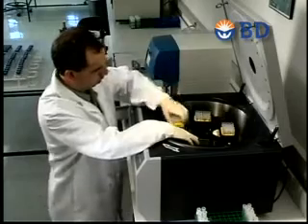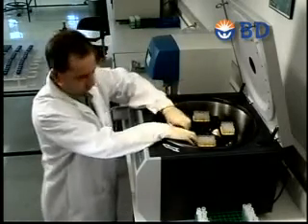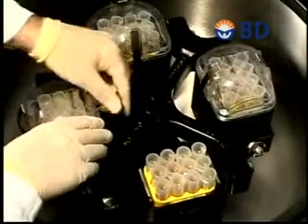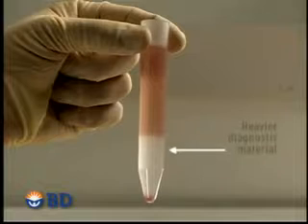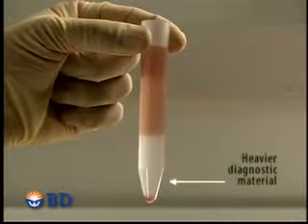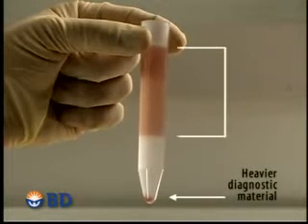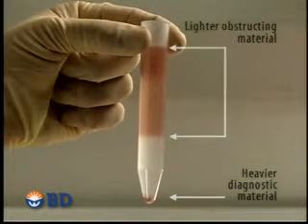With SurePath slides, there are 2 centrifuge cycles. The first, soft spin, takes a little over 2 minutes. In this cycle, the density reagent sorts particles based on size, shape, and density. Heavier diagnostic material is allowed to pass through the gradient, settling to the bottom of the sample, while lighter red blood cells, mucus, and approximately 50% of the inflammatory cells remain trapped in the sample layer above.